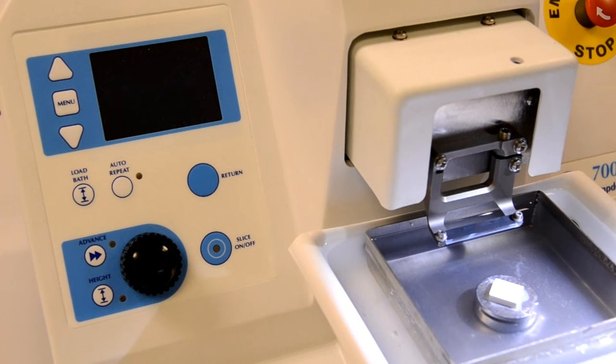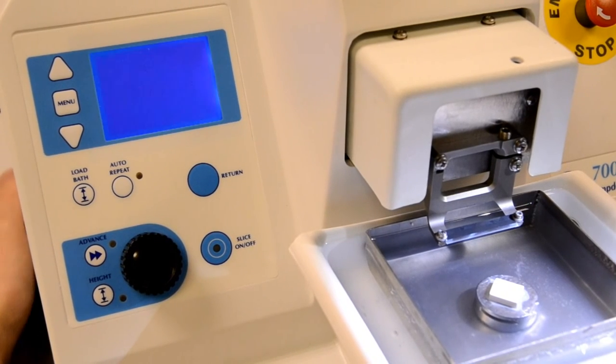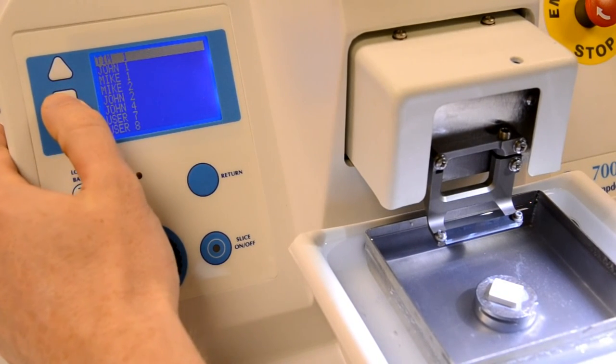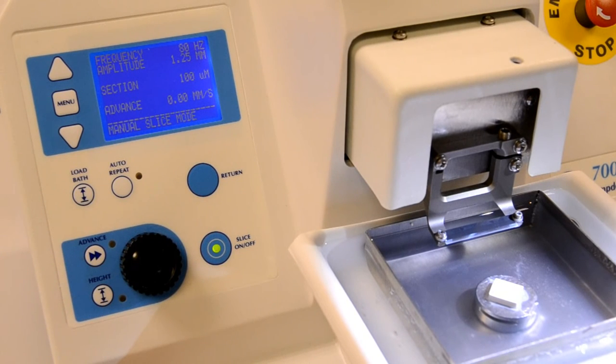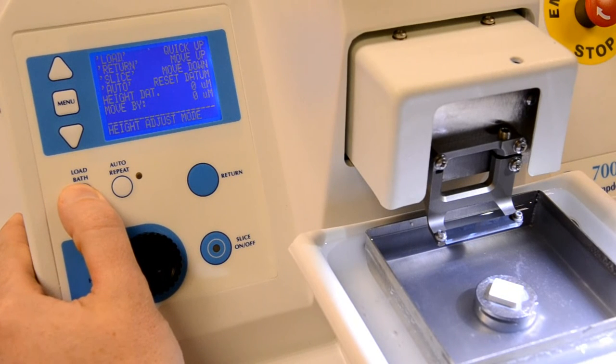When the instrument is switched on, select the preferred user or press the menu key to reach the normal operating screen. Note that the slice on-off key is now illuminated green and the display shows the operating parameters with advance speed shown as 0 millimeters per second.